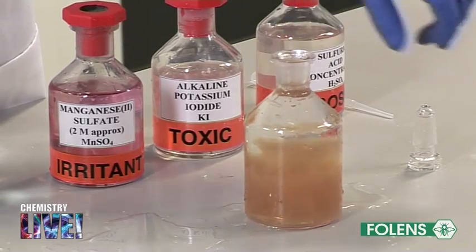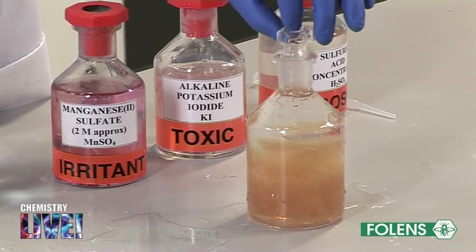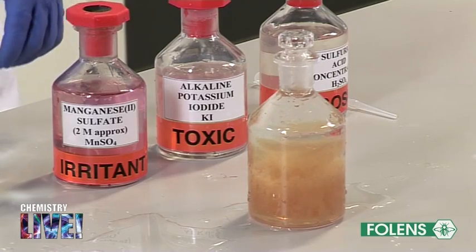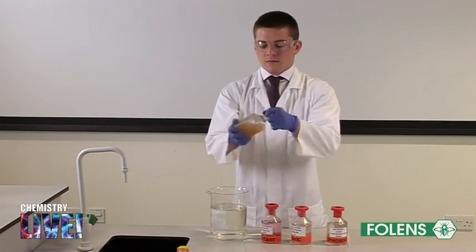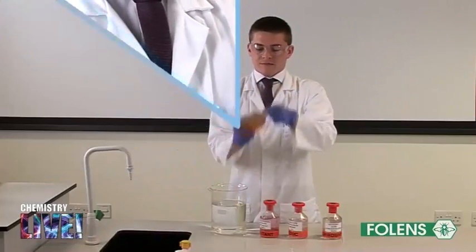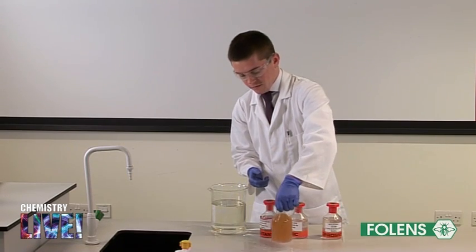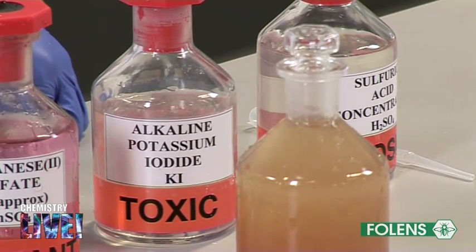Stopper the bottle. There will be a slight overflow of water when stoppering. Shake the bottle vigorously for about half a minute. Allow the brown precipitate to settle for a few minutes until there is at least a 5 centimeter depth of clear liquid below the stopper.